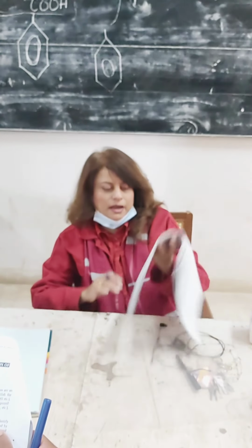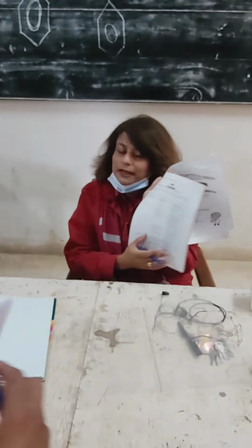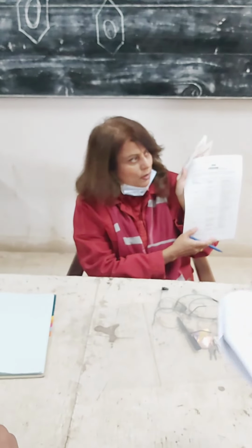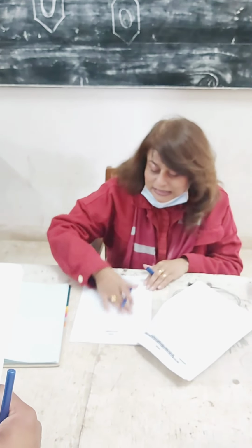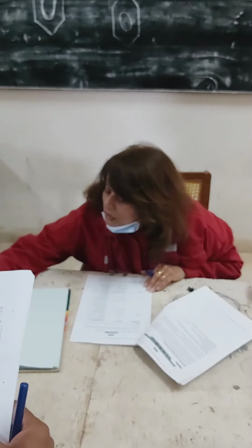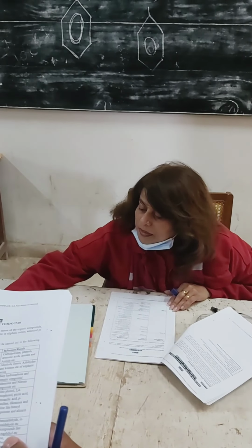This is the scheme. Here they have written 3 columns. You are going to make these 3 columns in your journal, and then you are going to write down the physical examination first. This is called preliminary examination. Now, what is preliminary examination?